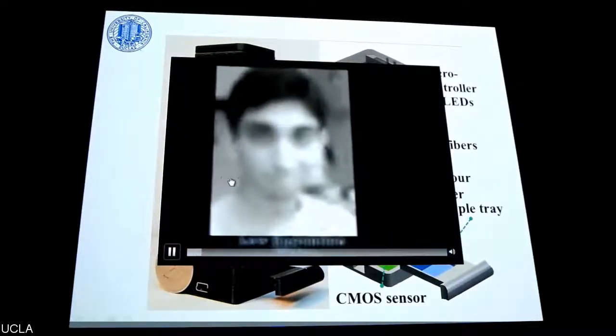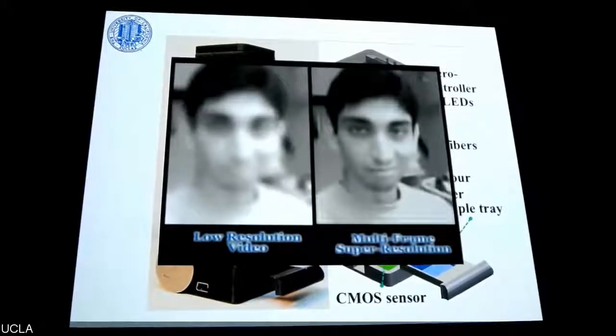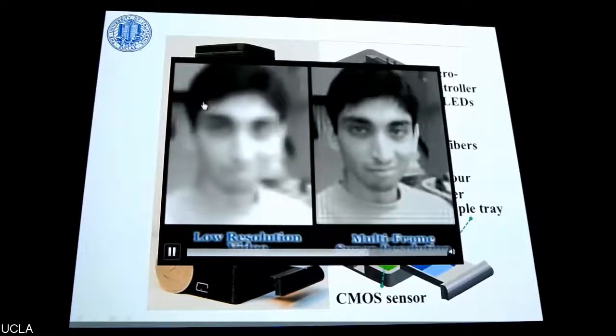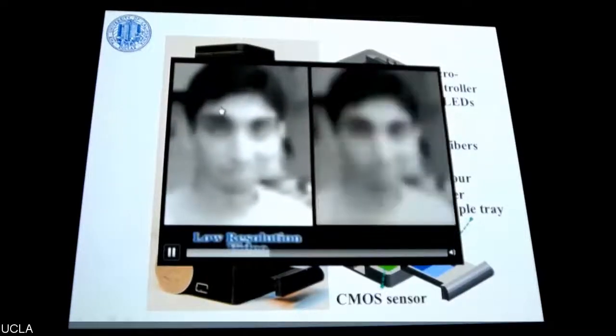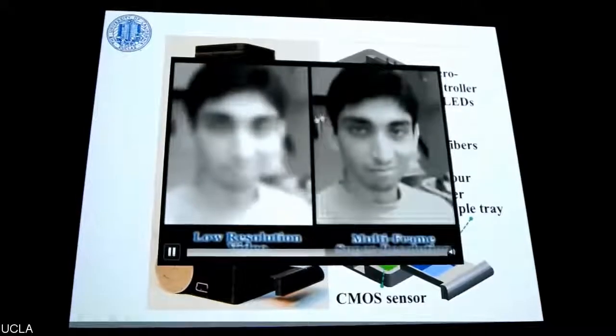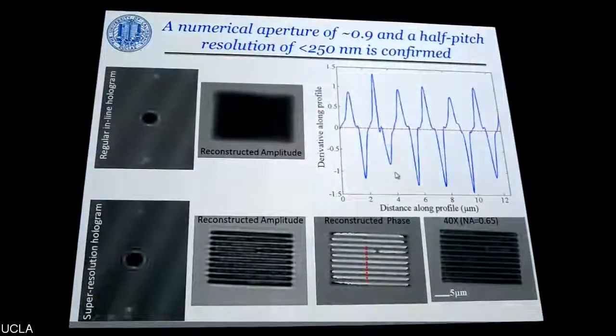But if the cameraman is slightly shaking his or her hand, you will capture a sequence of images, like a movie, where every single frame is slightly shifted with respect to the others. These are sub-pixel levels of shifts, and we can use this to reconstruct, mathematically, a much finer image of the specimen, of the sample. This is what we do at the micro scale using that source shifting, and mathematically we divide each pixel into smaller pixels.